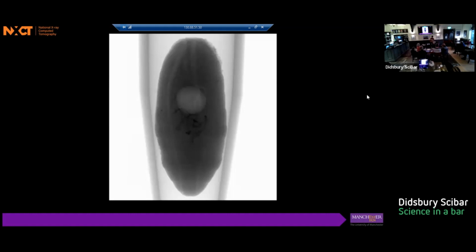But the other strange thing about insects is they're extremely X-ray tolerant, such as this little dude, which is a maggot. And you can actually see what we're looking at is it's moving. It's being blasted by X-rays, and it's still alive, which is ridiculous.